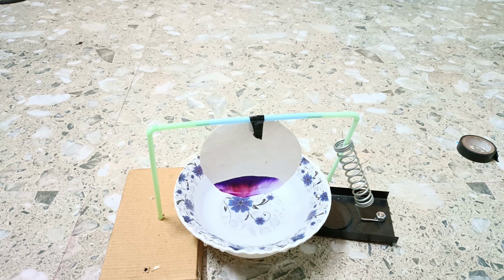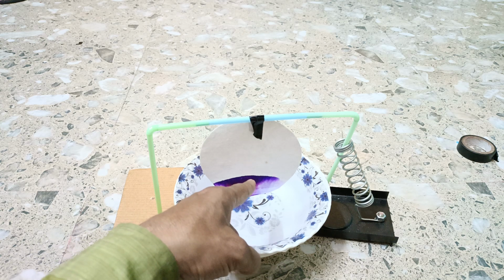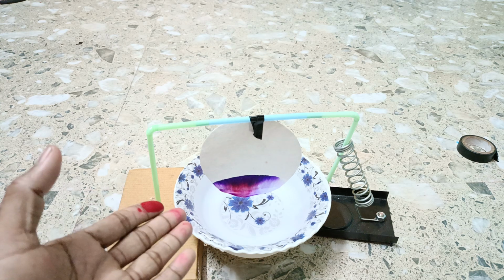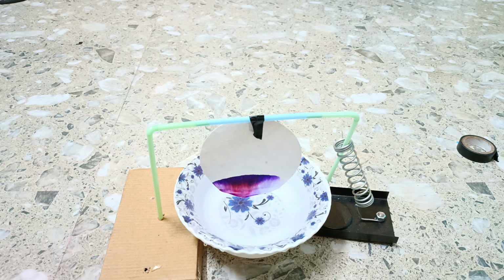The two colors will separate out due to the chromatography experiment. You see here one red color is there and another one is blue color, and you can see that the two colors will separate out from one another, and you can use this experiment to separate blue color and red color. And this is what we call paper chromatography. It will take some time, but you can see how the color is separated from one another.